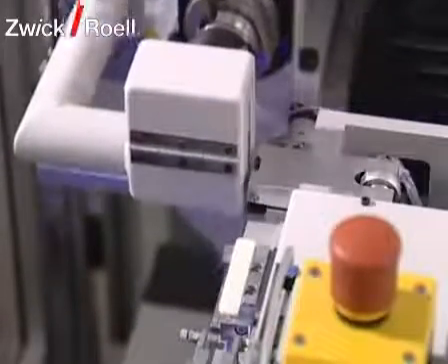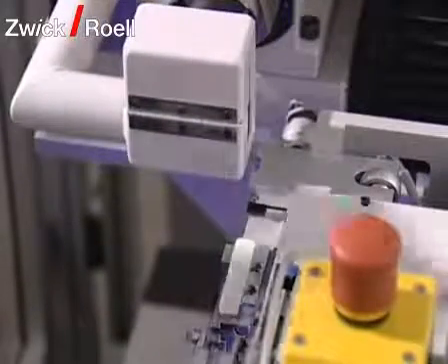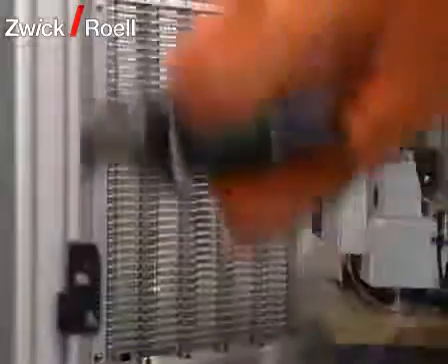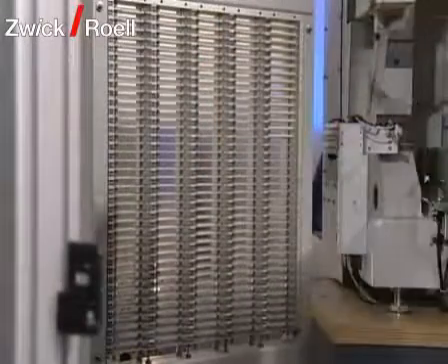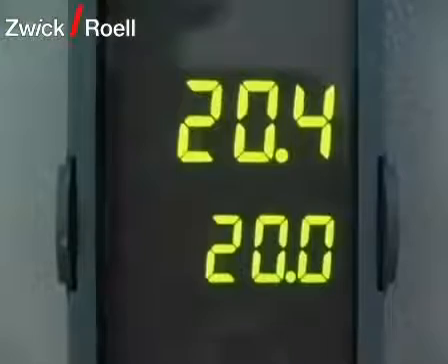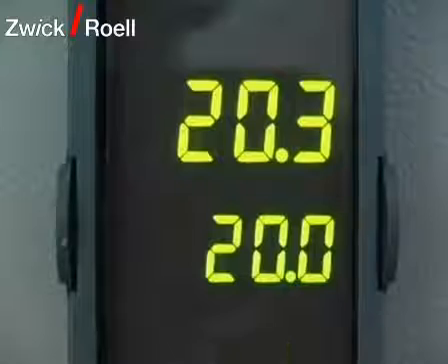After notching, the specimen is taken over by the robot again and placed in the interim magazine for a rest. The notched specimens are temporarily stored in the interim magazine until either: the pre-selected temperature in the temperature chamber has been reached, or the resting time of the specimens after the notching process has passed.